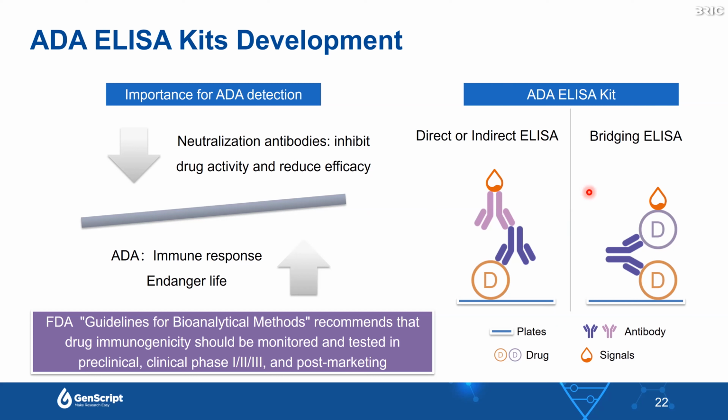In the ADA validation assay development, we perform direct or indirect ELISA. If an antibody drug induces the development of anti-drug antibody, it can be detected through direct binding ELISA. In this assay, an antibody drug is coated on the plate, and then the plate is incubated with the serum, and then the plate is washed with labeled IgG, which only binds to the constant regions of the anti-drug antibody. Therefore, the ELISA will only show fluorescence if there are anti-drug antibodies present in the sample serum.